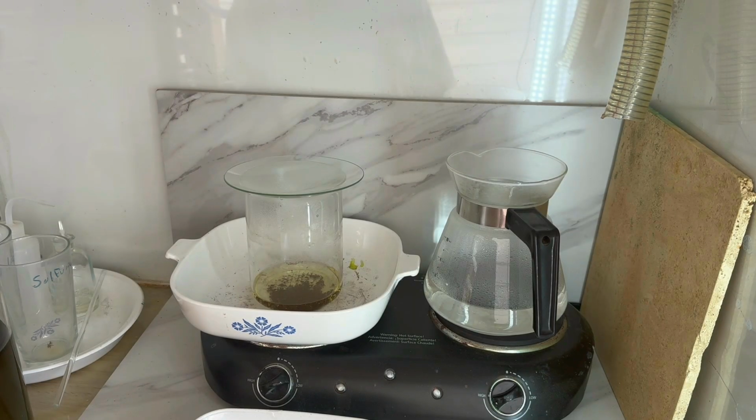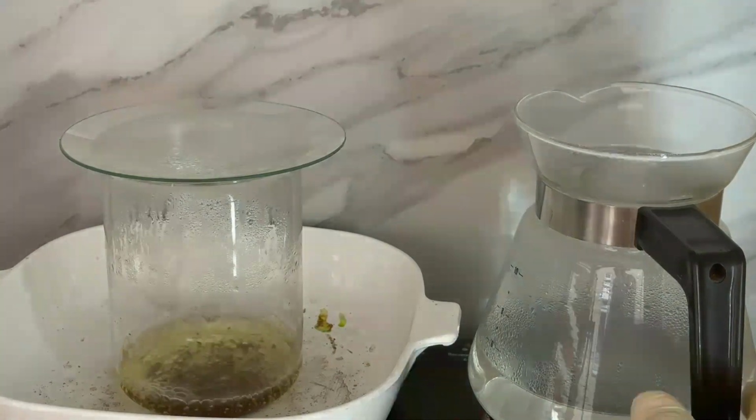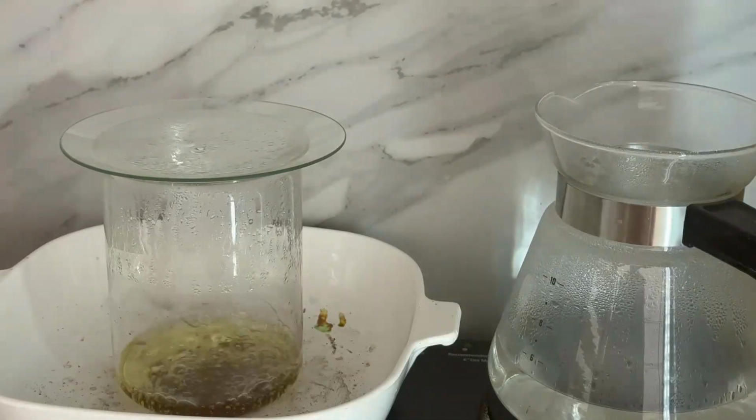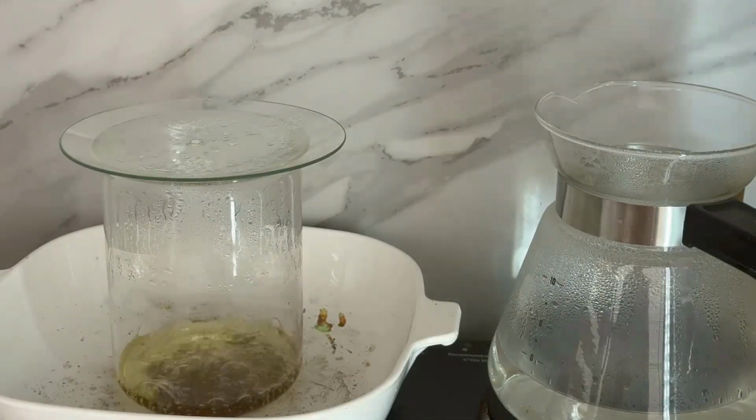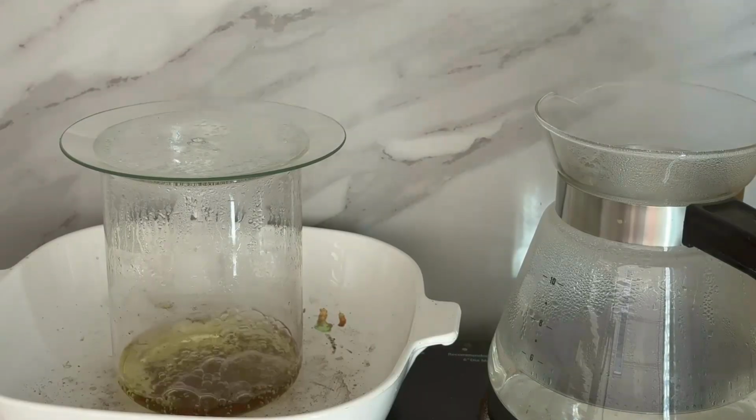All right, so our gold has settled. We've decanted off the solution, left the gold in the bottom. The first step of washing, we put some hydrochloric acid in here, and we're doing a quick hydrochloric boil. This is going to pull any additional metals out, and you can see from that yellow color that there are still some contaminant metals in this powdered gold.